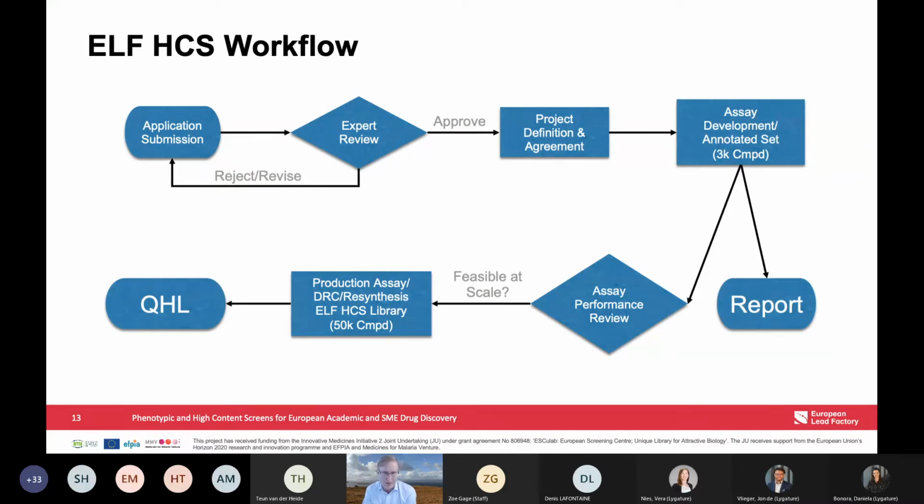Assuming that we are able to scale the assay, and we have had a lot of success there, we then take that forward, and that feasible-at-scale question is really about the assay metrics.